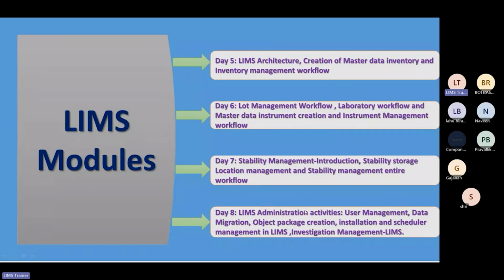For administration purposes, there is another course available, but for this course we have included administration activities that are related to LIMS software, and that also will be covered in the course in detail.